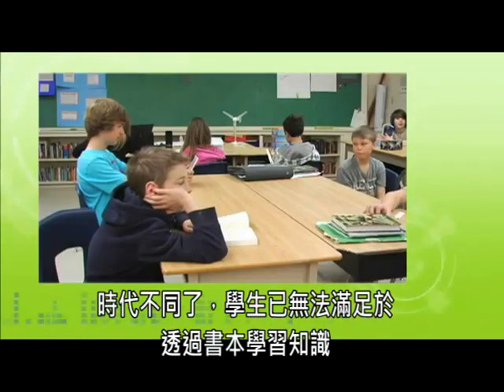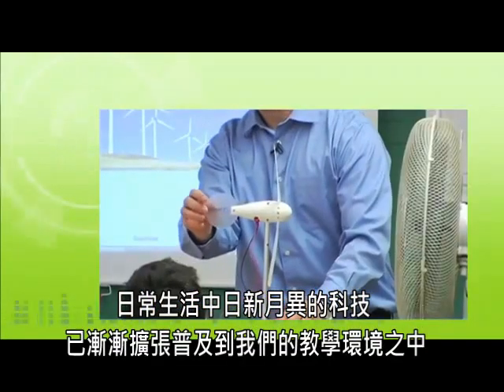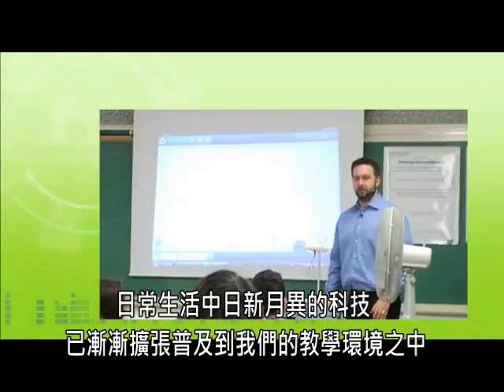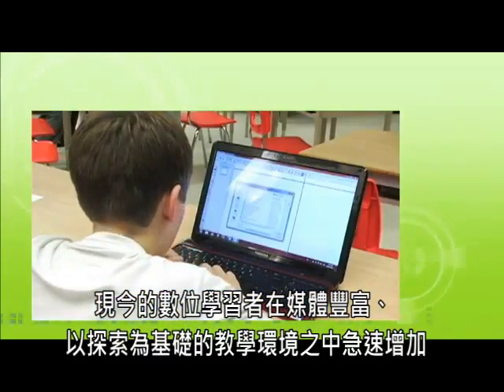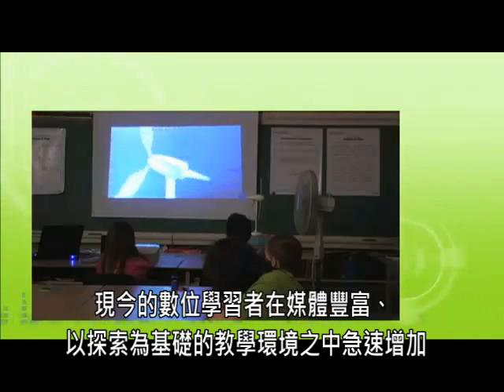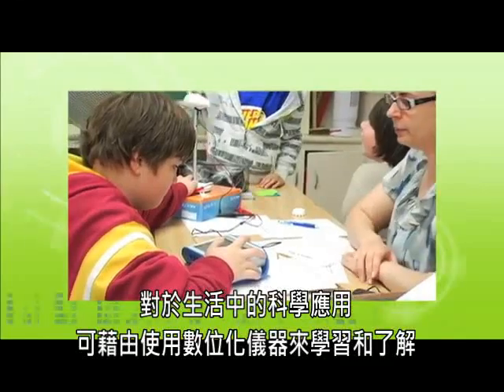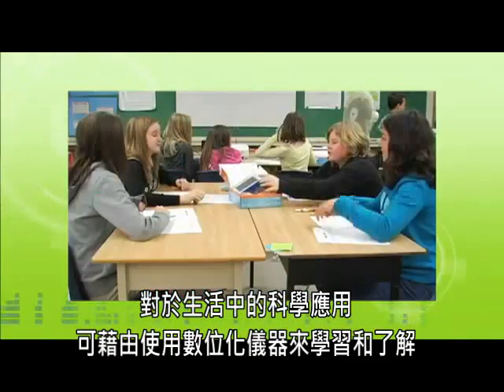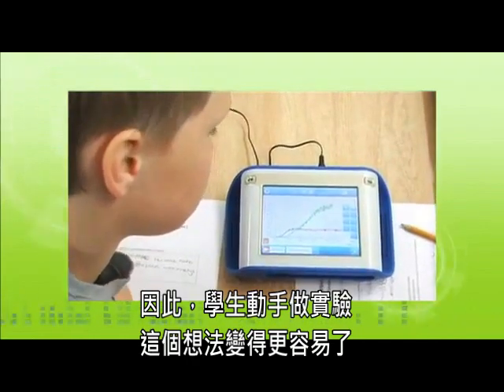Gone are the days when students were content learning through textbooks. The exponential explosion of technology in our everyday lives has spilled over into classrooms throughout Canada. Today's digital learners thrive in media-rich, inquiry-based teaching environments. Student-driven investigation with real-life applications is made possible with tools such as Pasco's Spark Science Learning System and SparkView software.